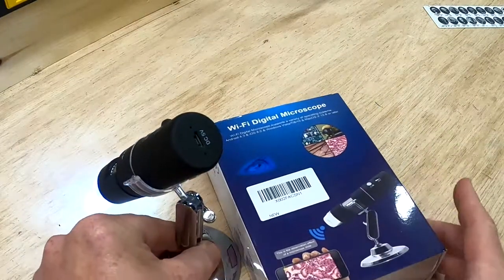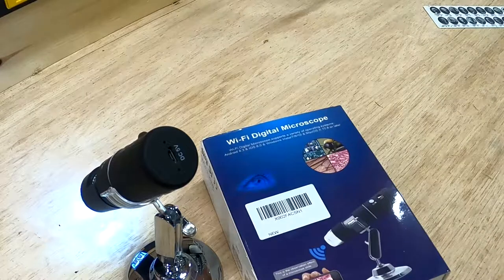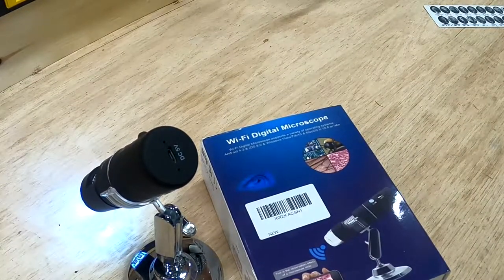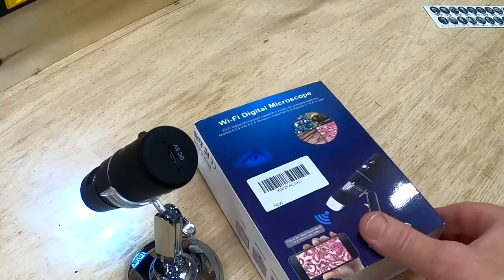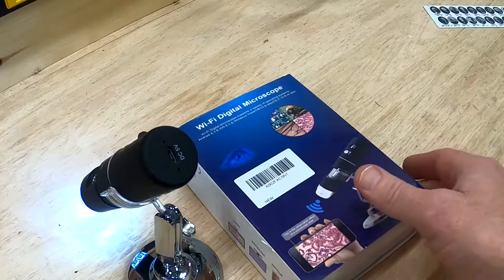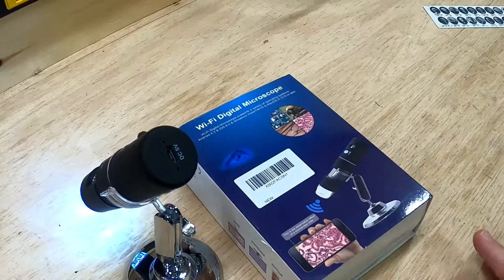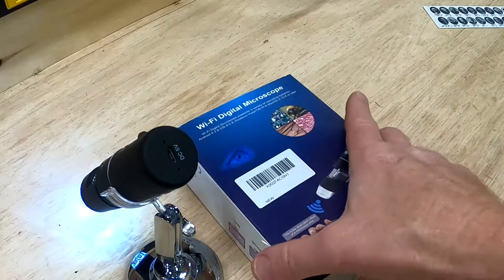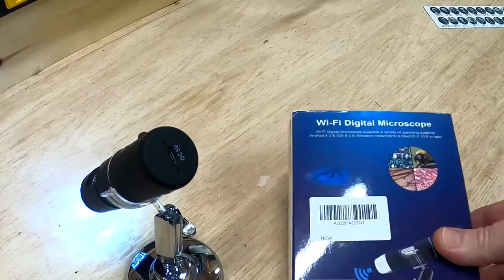Today is Fun Friday, November the 6th. Every week from now until Christmas, every Friday I'm going to review another toy, and the week of Christmas I'm going to give away one of these toys. This is not really a toy — well, it is a toy — but I think it's a great tool to have if you have a kid interested in science.